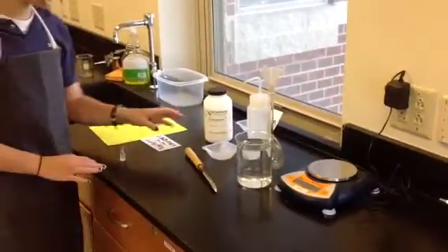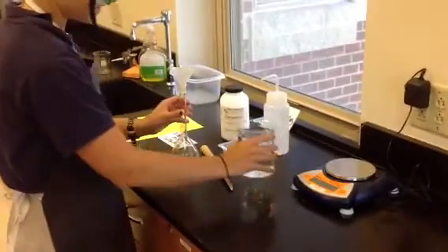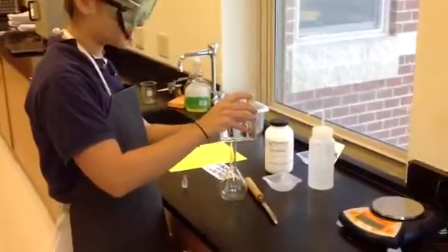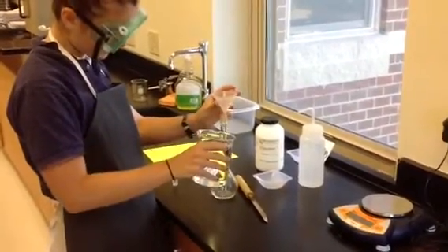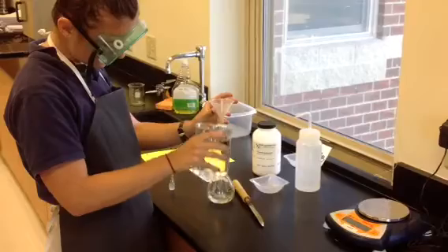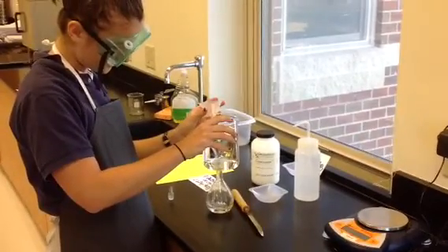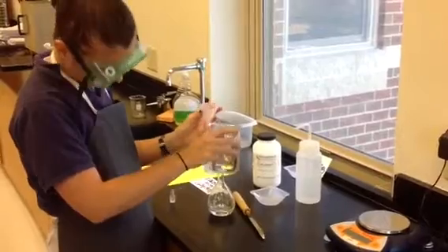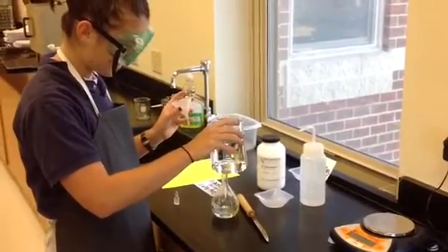First I got my volumetric flask and I'm going to fill it halfway with distilled water — you just eyeball this. You just eyeball halfway, and this is the only time you ever eyeball.